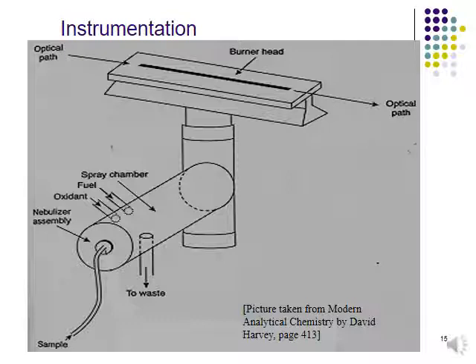So the function of this is to make your liquid sample become small, I mean to become small in particles, very tiny particles.